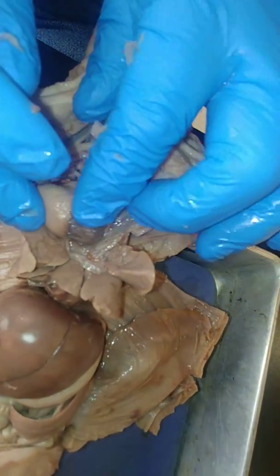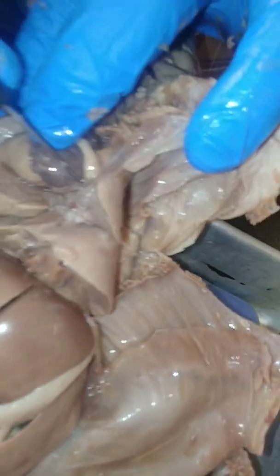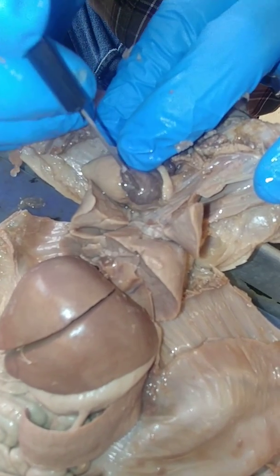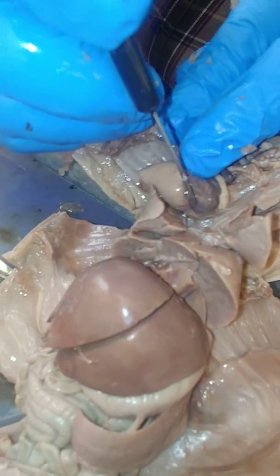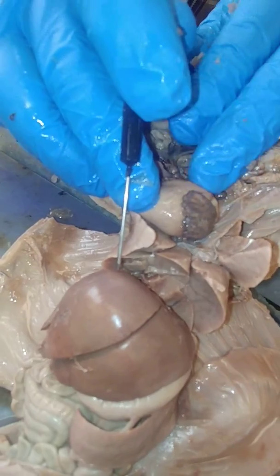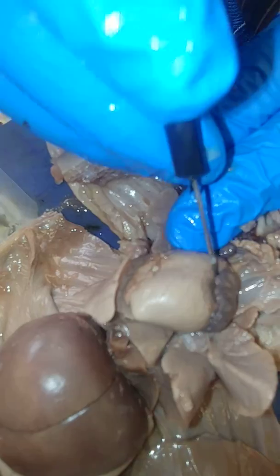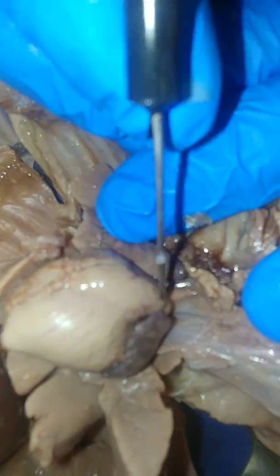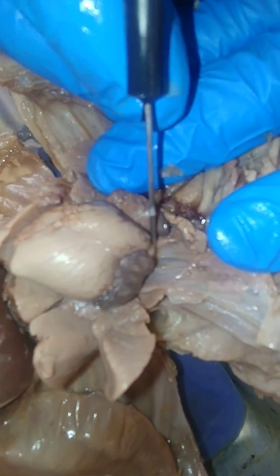Okay, then we go over to this side. And we've got some connection areas here. These are the pulmonary veins coming in. One's coming from the right lung, and the other one's coming from the left lung, and they're going into the left atrium. Coming out the top, curving like this and going towards the back, and you've got some branches. You can see this one right in here coming off it. This is the aorta, largest blood vessel artery in the body.